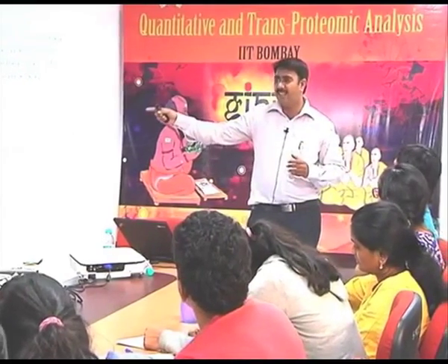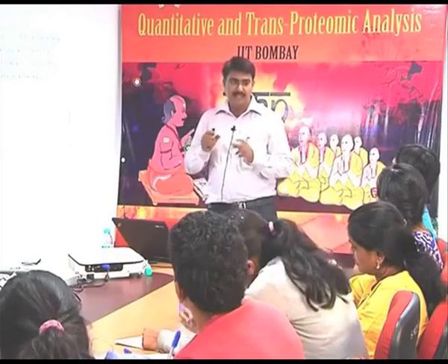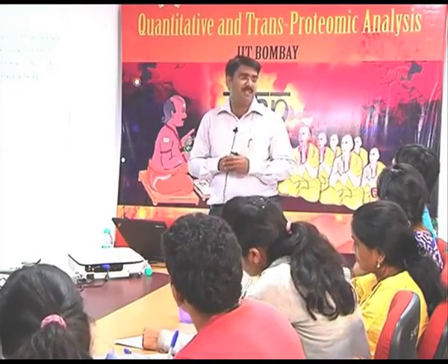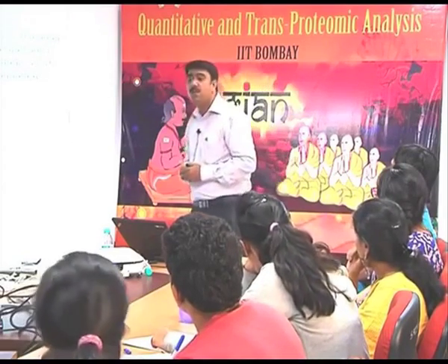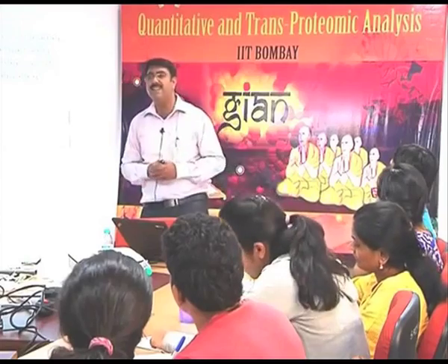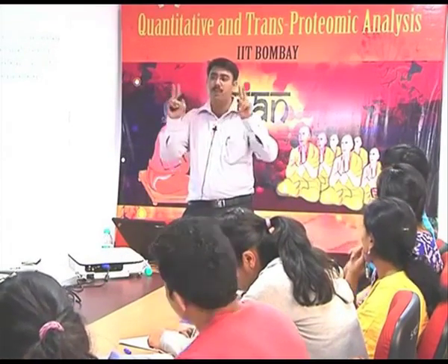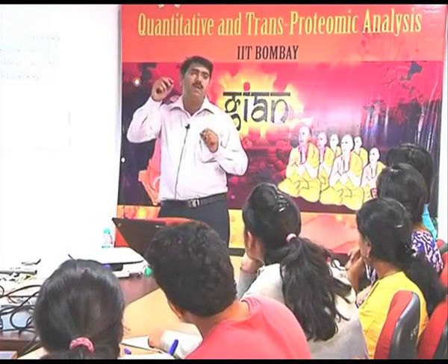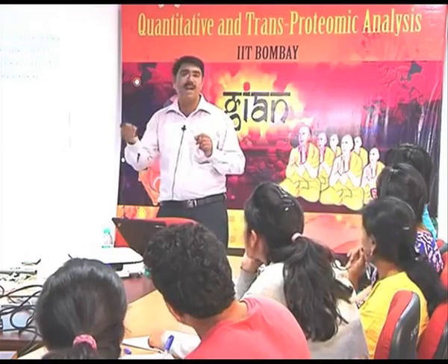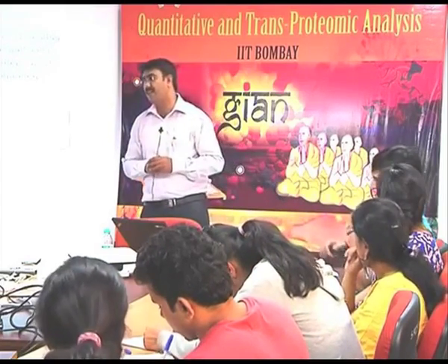I think there is one technology called NanoTemper, which is once again a solution based, solution interface technique. Here I am going to discuss the solution solid interface. What exactly is the solution solid interface? Suppose two proteins are interacting together, one protein we have to put on a solid support and the other should be in solution form. That is what we call a solution solid interface.